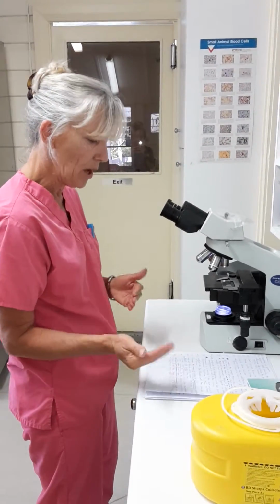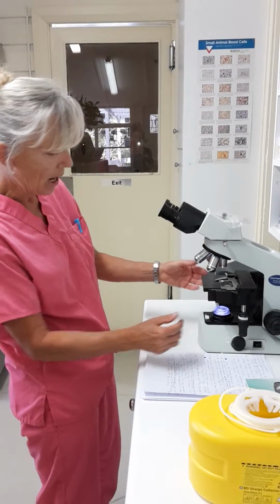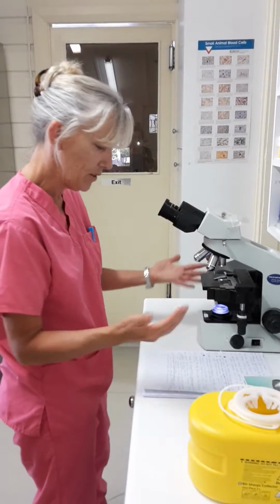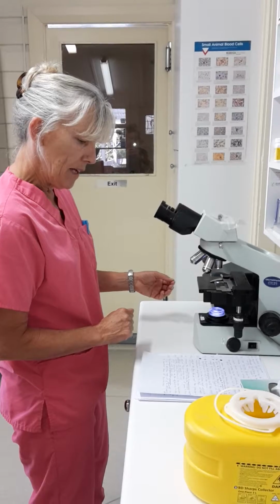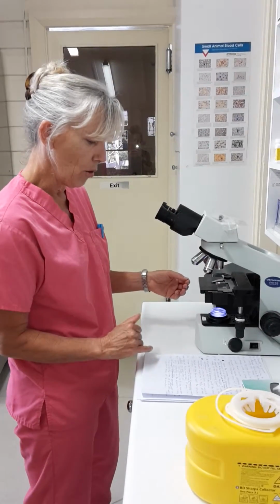The next step is one of those, and we have to adjust the condenser height until the edge of the incoming light is sharp, and we would do that with something that should be around here so that it would go up or down, but we don't have it, so I'm pretending that we do. We then expand the field diaphragm until the black background is no longer in view.